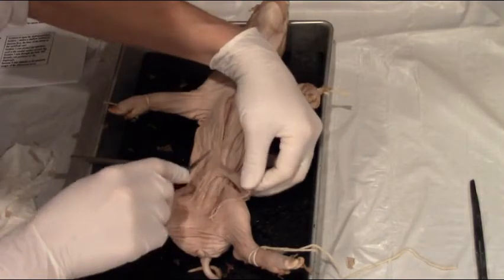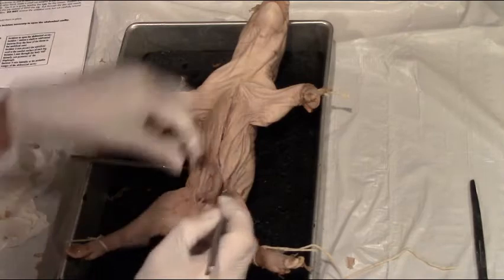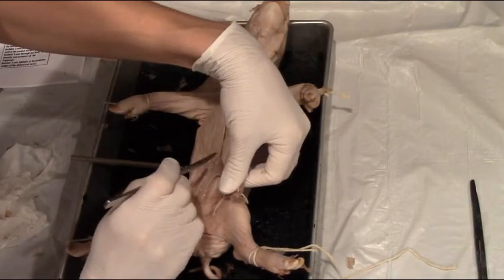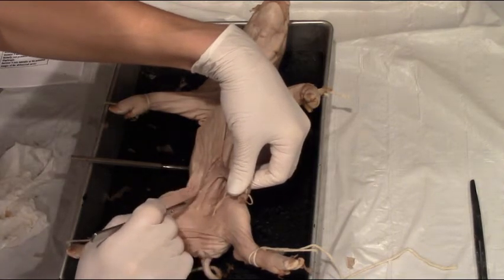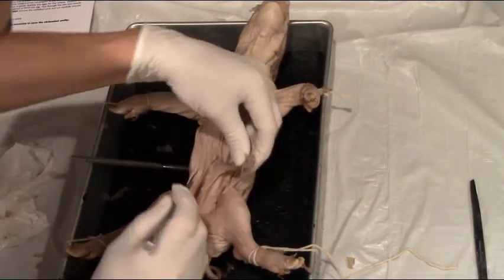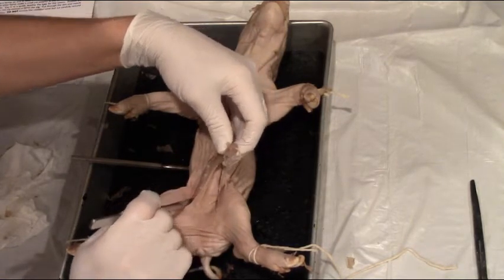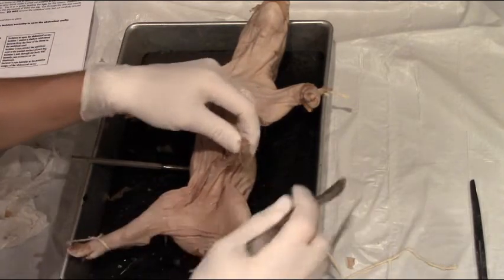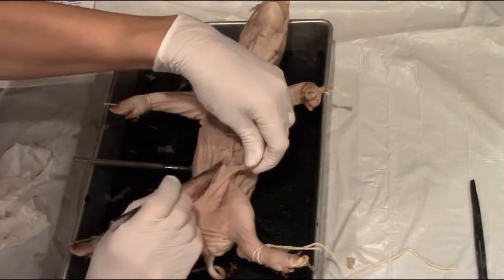I've cut on one side and I'm cutting on the other. I just keep moving back and forth making slow, gentle, shallow cuts. I can keep going back over things if I need to. You want to cut to the medial surface of each leg — the middle hip area of each of the pig's legs.